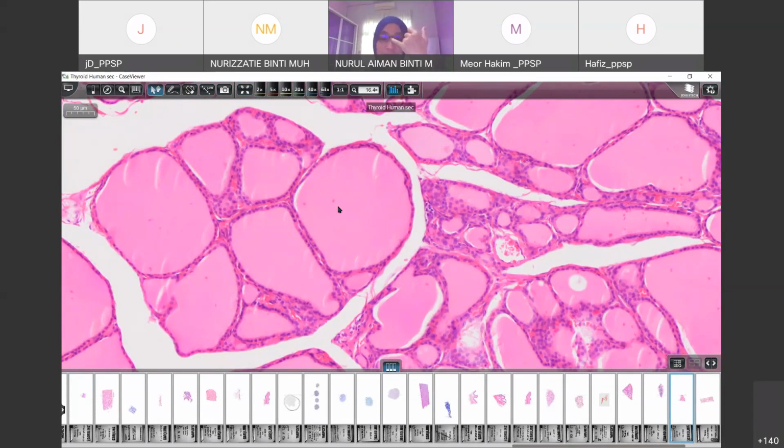The thyroid gland produces the T3 and T4 thyroxine hormones to increase your heart rate in case you have stress, so that you can withstand stress or emotional factors. Of course they don't have ducts.